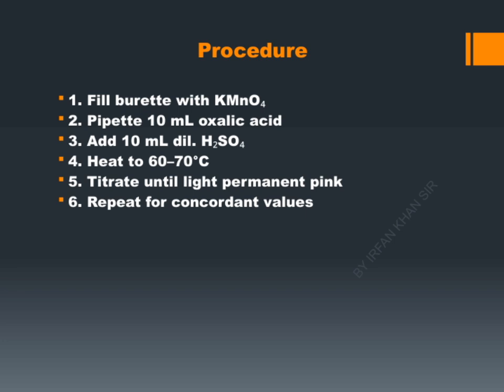This acid helps to maintain the right acidic environment for the reaction. After that, I gently heat the mixture to a temperature between 60 and 70 degrees Celsius. Heating speeds up the reaction and ensures consistent results.